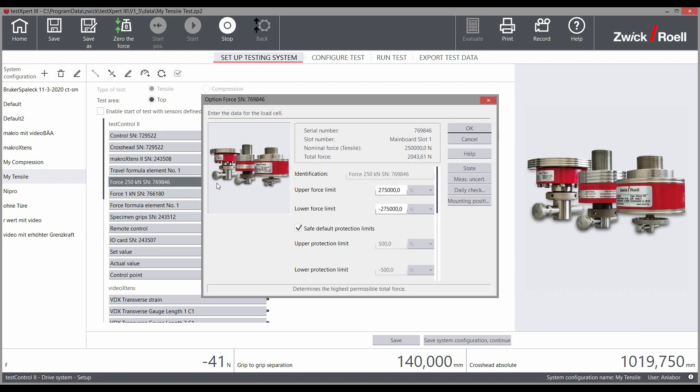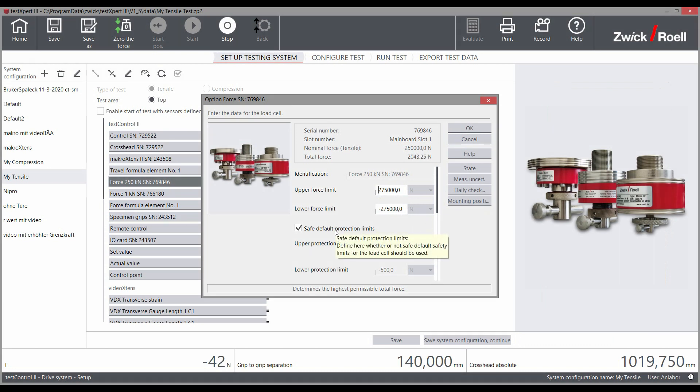There is also force monitoring outside of the test that stops the testing machine once even a slight increase in force is detected, which guarantees maximum user and machine safety.